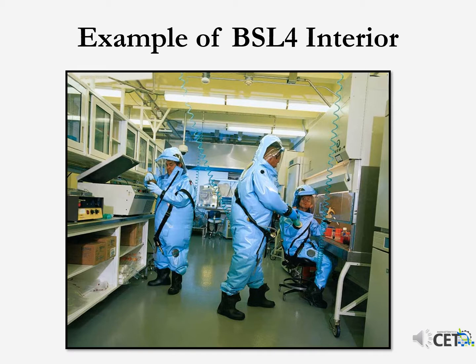The mechanical features and the design features of these labs are increased. The reason I would go through that with you is not that you'd ever work in here, but these rooms are not rooms you would accidentally walk into. They are deep within a building, isolated, and you can't just walk into them. There are many rooms that you have to walk through to get into these rooms, ante-rooms and preparation rooms. So we'll go through some of the mechanical features unique to these.